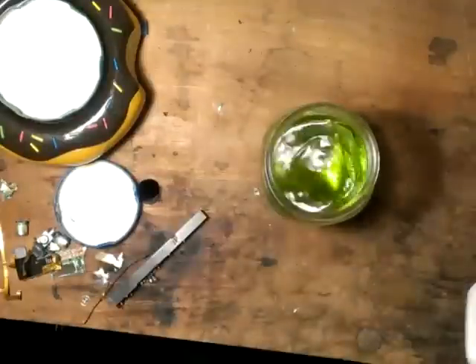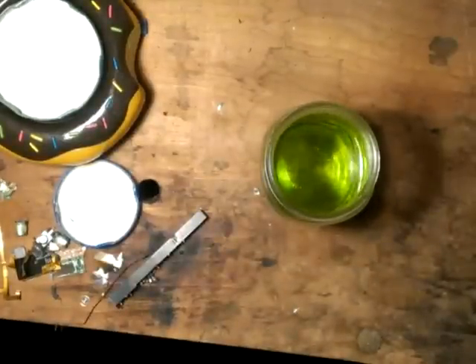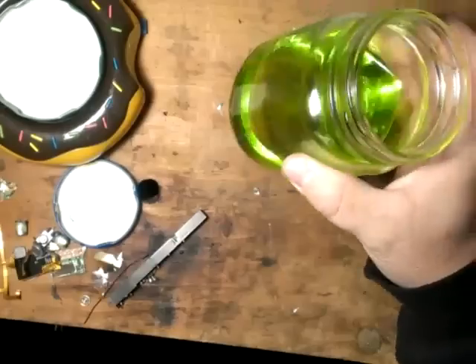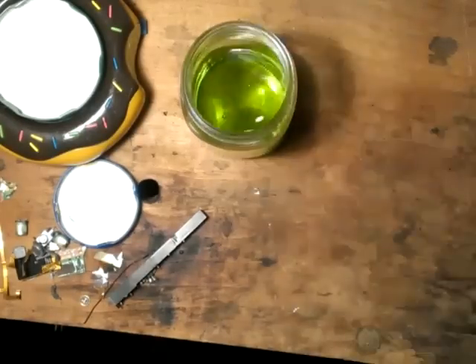Hello everybody, back again. I'm going to drop some gold from my acid bleach mixture. I've already dissolved the gold, filtered it, so I have a pretty clean liquid there.